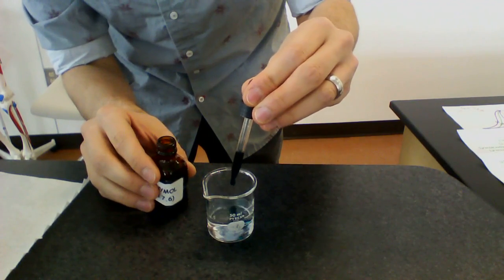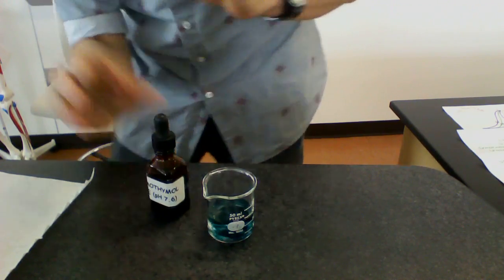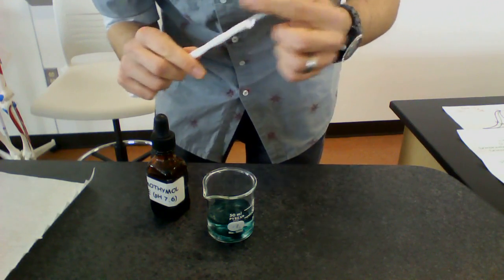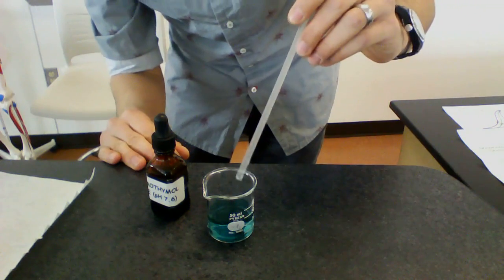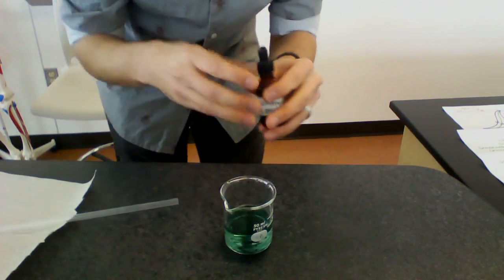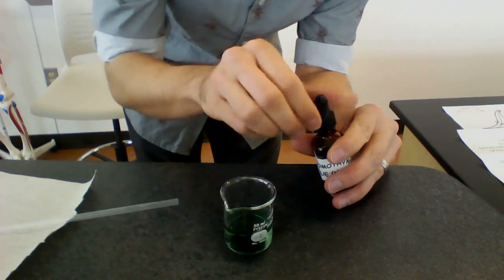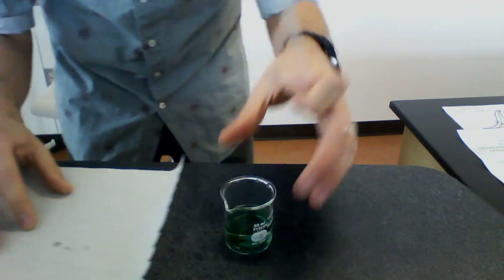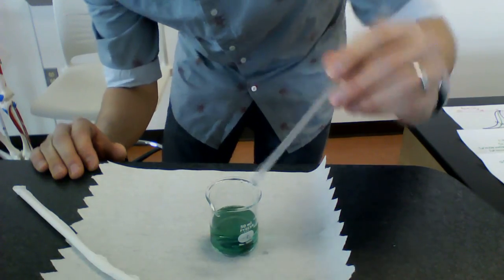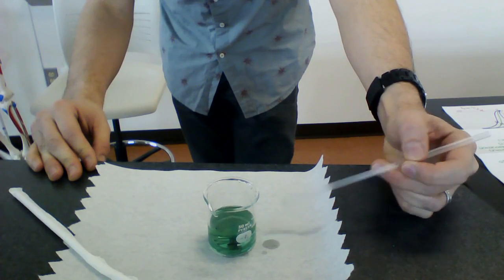So we'll see how this works. Sometimes I need to give it a little stir. So I have a straw here. Okay. So I don't know how well your color is. Maybe I can give it a little bit more, but it's a nice green color here. Maybe I would put it back on there. There you go. Now we can see that this is green. So we have this water at pH 7.0, and we have our pH indicator in there.